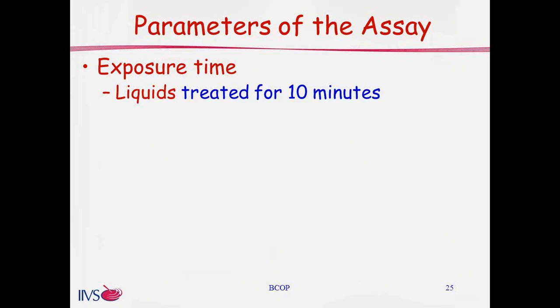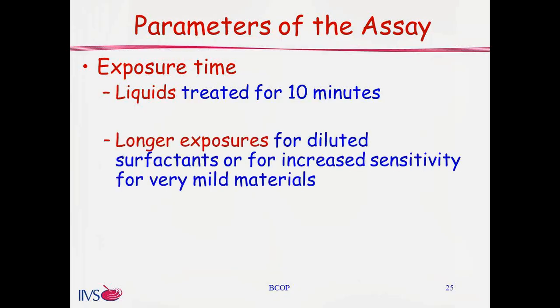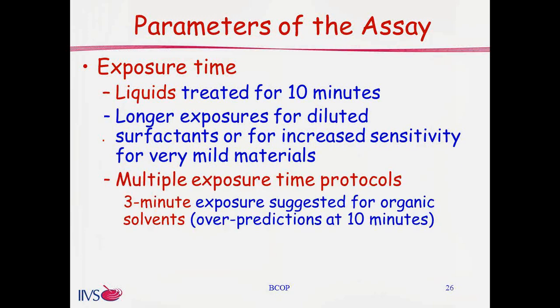Now, for the exposure times for the test system, liquids are treated for a classic 10-minute exposure time. There are times when longer exposures might be useful, for example, for very dilute surfactants, or in cases where, in testing very mild materials, one may want to gain increased sensitivity to compare among very mild formulations. One can extend that exposure time. We have a number of protocols that allow for 30 to 60-minute exposures. Again, these are outside of the definition of the OECD guideline, but are more typical for a product development application.